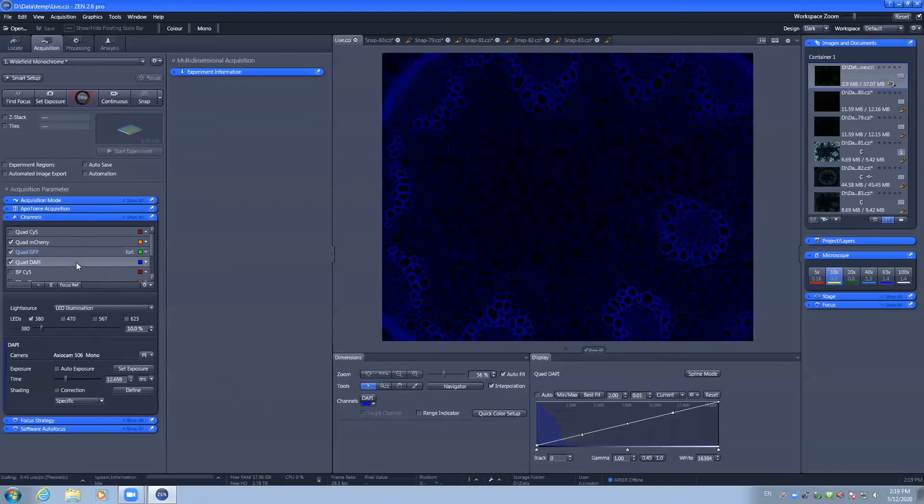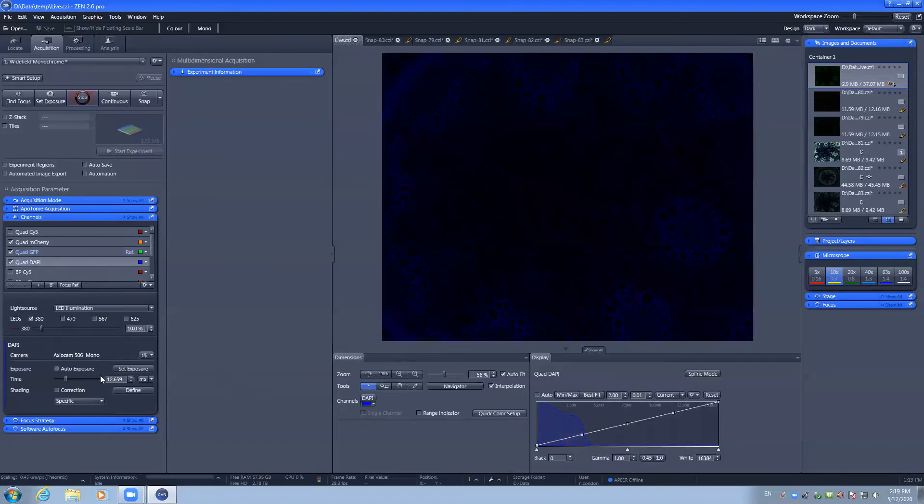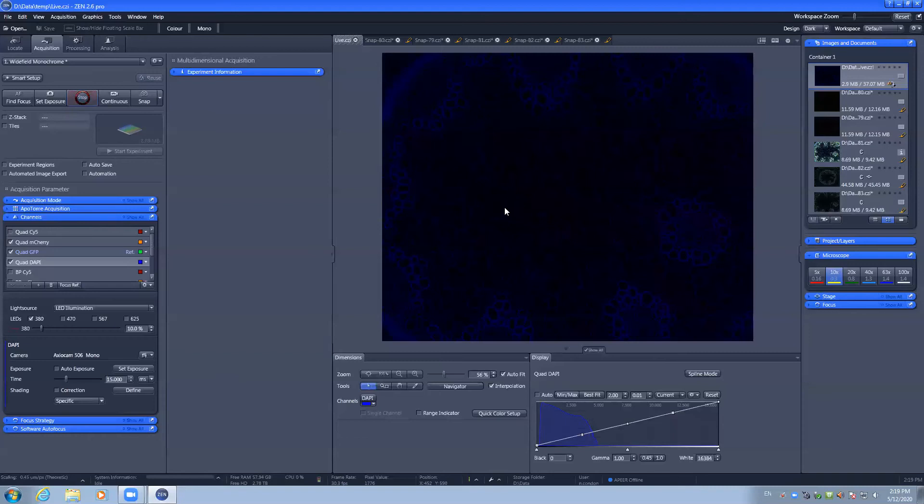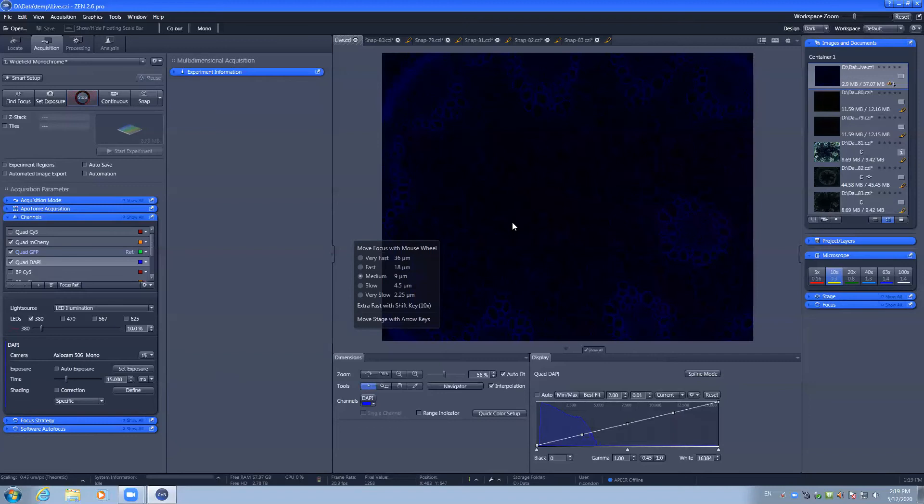For the DAPI, we also have a 12.659 millisecond exposure. Should you feel you need to adjust the focus of the image further, you can use the CTRL key and scroll the wheel up and down to ensure you are in focus.